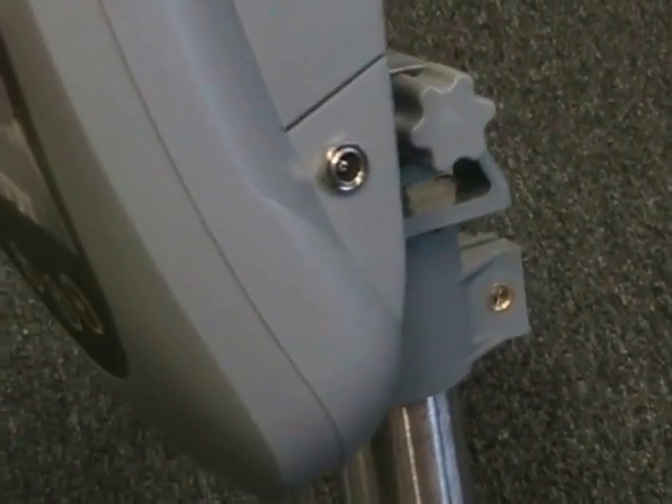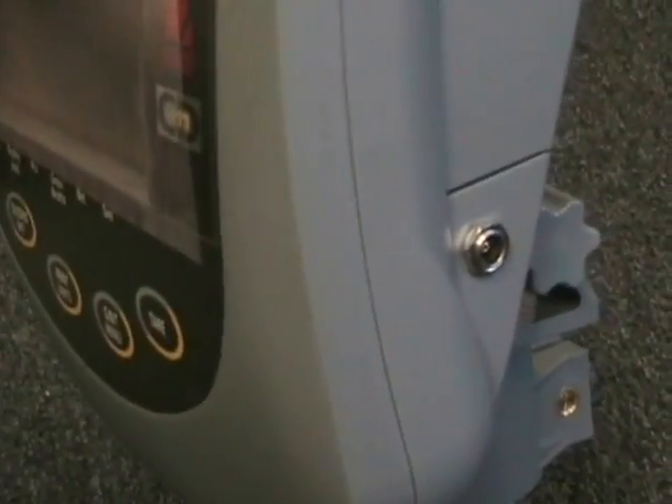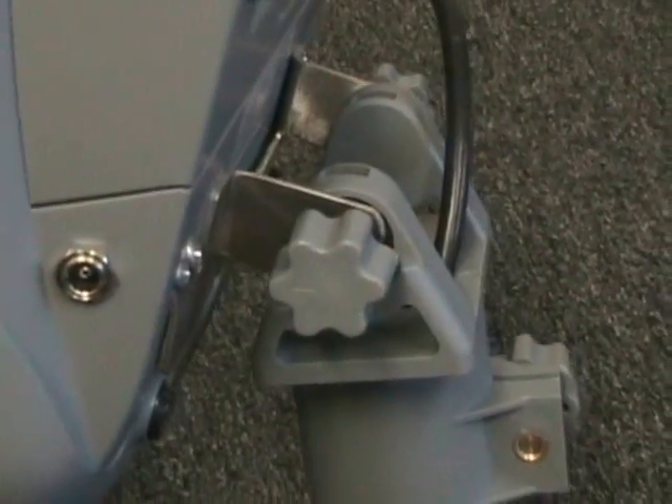Whether you are weighing in kilograms, pounds, or ounces, the CHAMP II signifies a great value in bench scales.